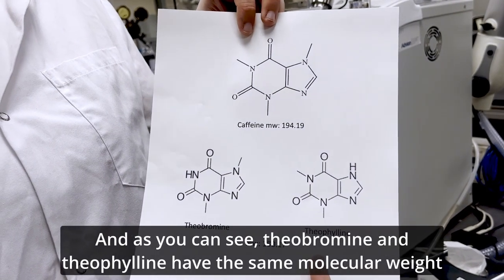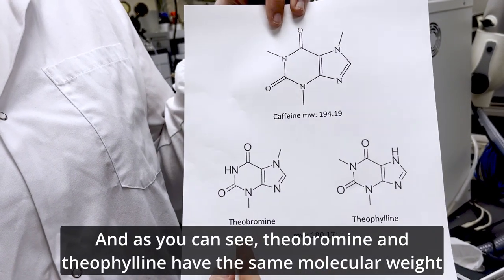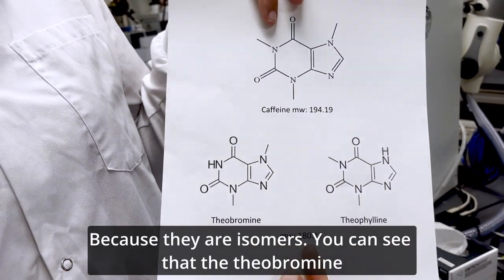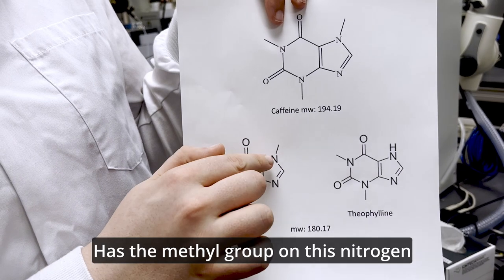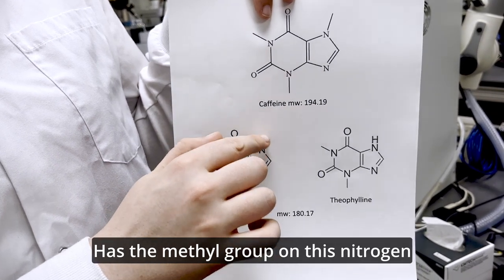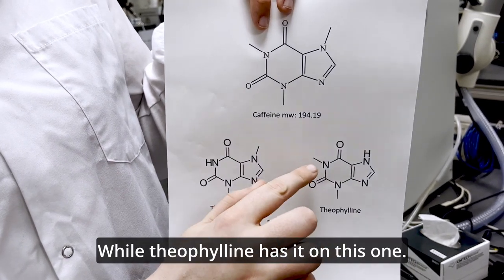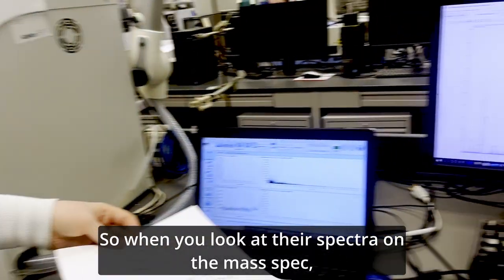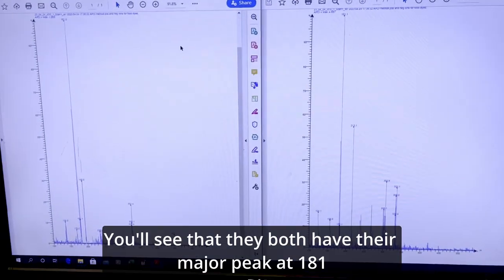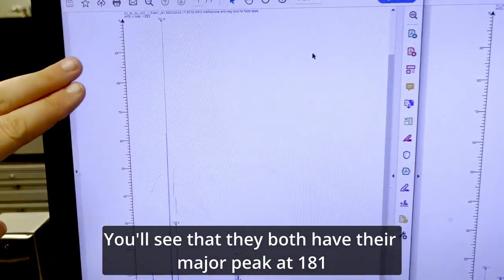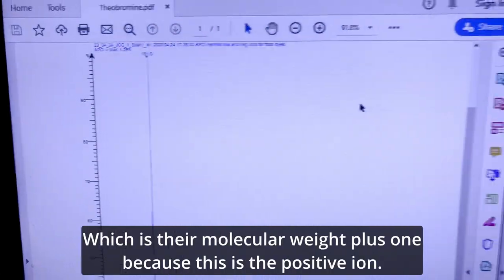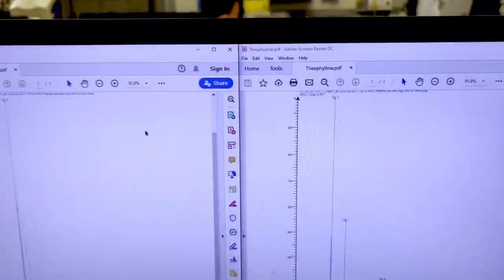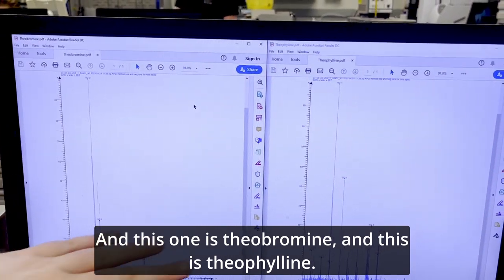And as you can see, theobromine and theophylline have the same molecular weight because they're isomers. You can see that the theobromine has the methyl group on this nitrogen, while theophylline has it on this one, but they still have the same molecular weight. So when you look at their spectra on the mass spec, you'll see that they both have their major peak at 181, which is their molecular weight plus one because it's the positive ion.